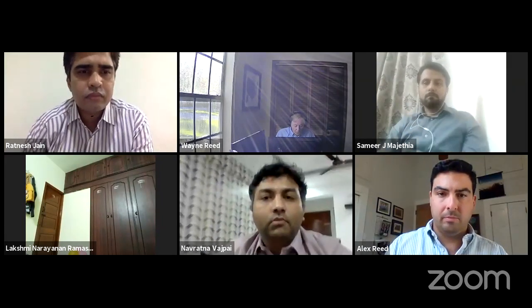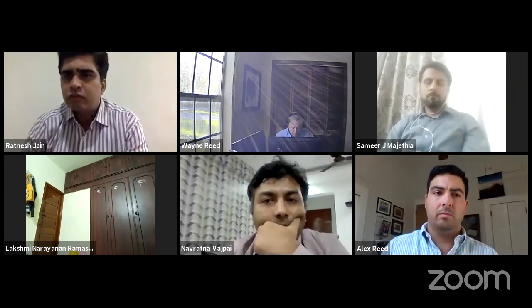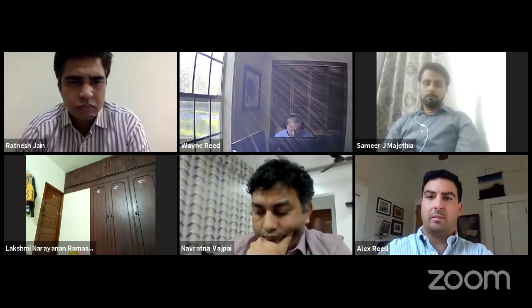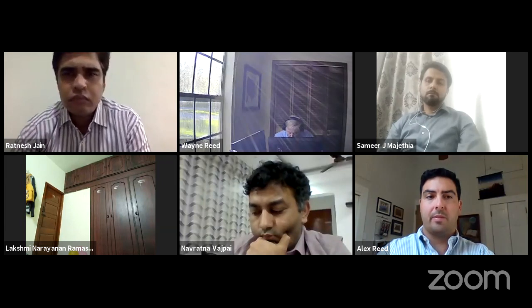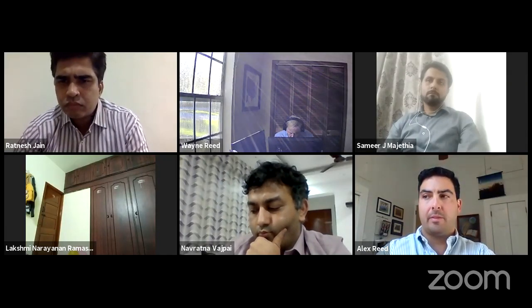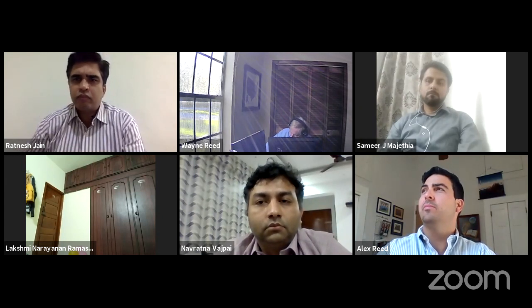Thanks, Dr. Reed. That was very interesting. I appreciate your presentation. It certainly seems like this has the potential to be used significantly in a lot of comparability studies. When I look at the kind of data you have presented, be it the thermal, the agitation, or the pH, it gives me a tool to look at protein stability and aggregation under conditions where we are trying to make a process change, change a facility, or add a new scale to our operations. So this gives us a very good tool, and I think it's really useful.